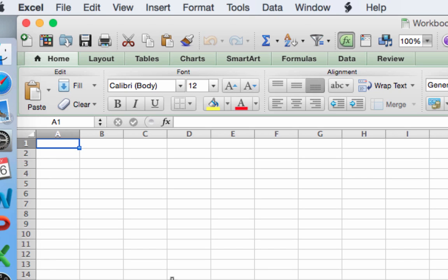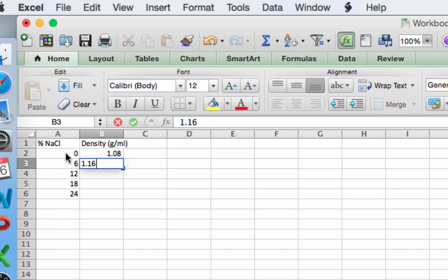When you open Excel, you should see the spreadsheet arranged into columns headed by letters and rows indicated by numbers. Begin by entering your variables into two columns on the spreadsheet. I'll first put my fixed variable into column A. It's always a good idea to label your columns so you can understand your spreadsheet when you look at it later. And I'll put my dependent variables, my density in grams per milliliter into column B. Okay, so you'll be given 0%, 6, 12, 18, and 24% sodium chloride. And just for practice sake, I'll make up some densities that you might get and enter them under my density column.